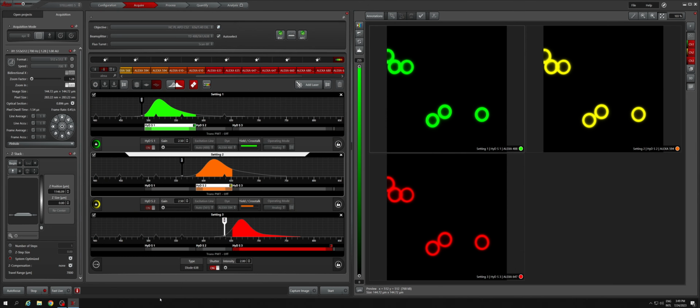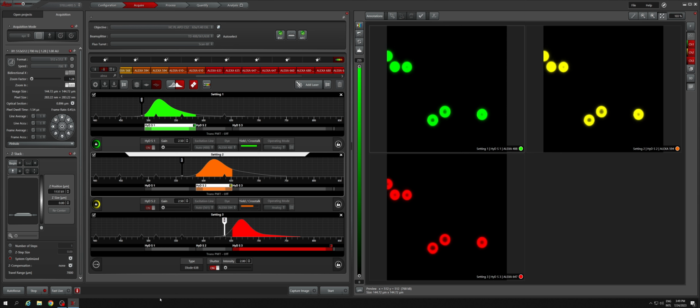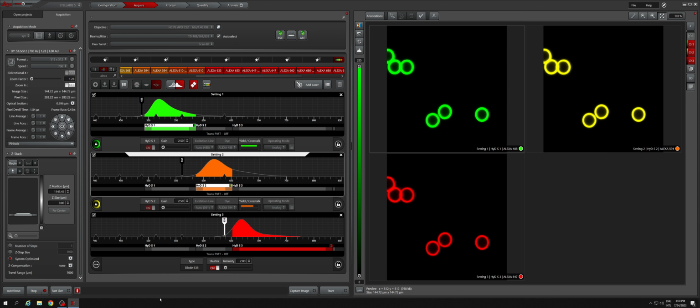Okay, and so if we now go back over to the software, what I usually do is use that Z focus control knob to focus up and down through my sample. And basically what I'm looking for is pretty much the center of the sample, or if it's a particularly bright area, I'll concentrate on the brightest region. But in this case, because it's a hollow bead, I'll go right for the center, and then when I get that position, then I can start adjusting the colors.